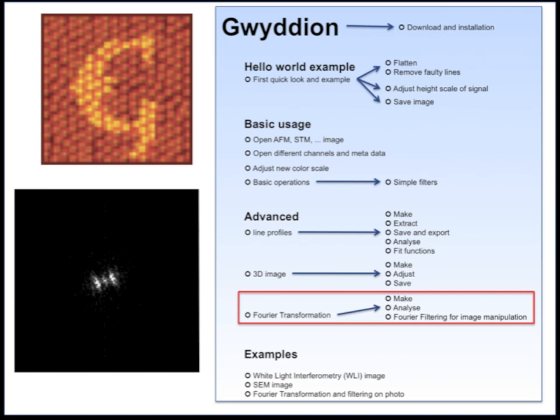In the next few tutorials I will show you some examples: how to open a white light interferometry image, how to open an SEM image, and how to manipulate a photograph.